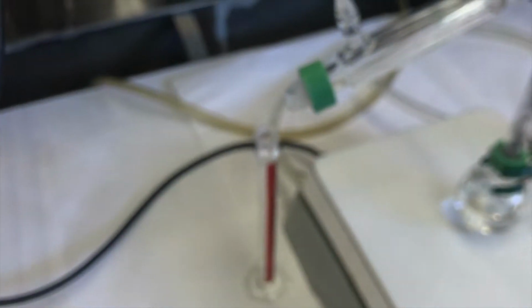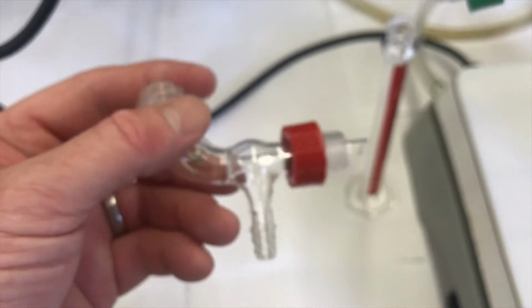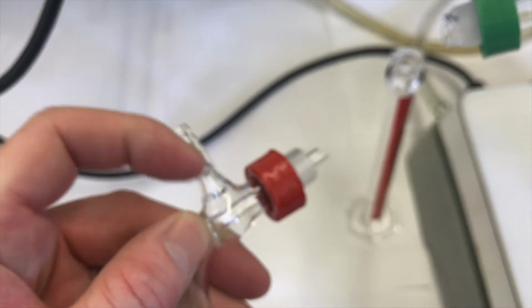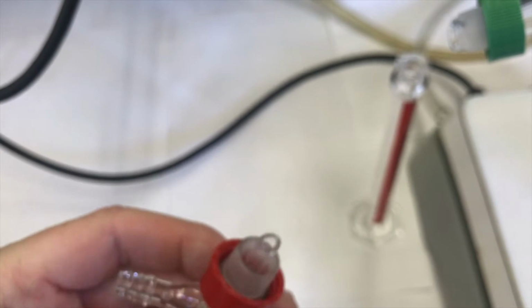And next will be the vacuum adapter. The vacuum adapter is pretty cool too. If I wanted to, I can hook up a vacuum hose here, and it'll draw a vacuum through this area and then through the little guy. That's where our liquid's going to come out. So you can get liquid. You can do a distillation under vacuum with that.